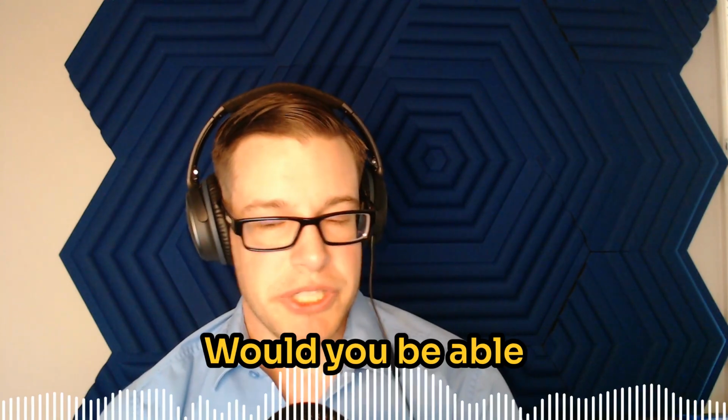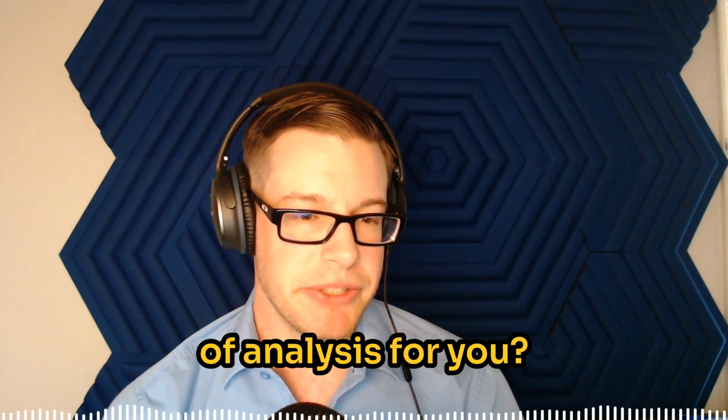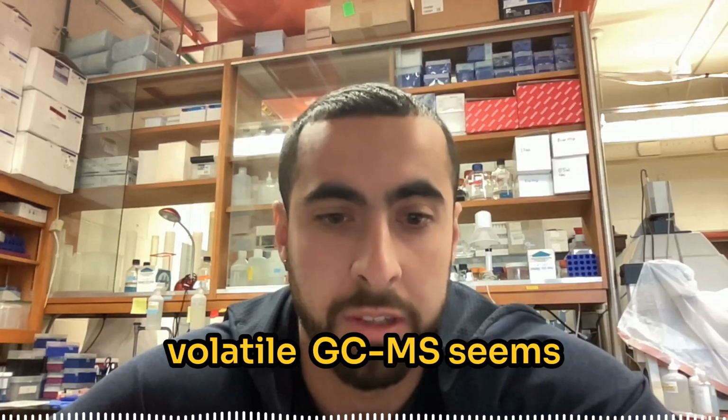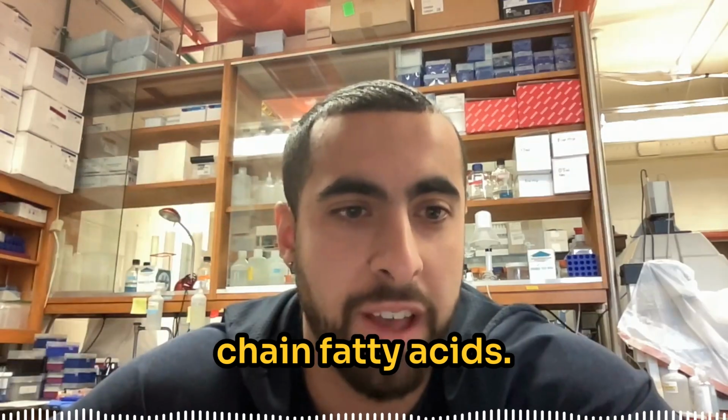That makes sense. Would you be able to talk about why GC-MS is the right type of analysis for you? Yeah, so traditionally with volatile molecules such as short chain fatty acids, since they're volatile, GC-MS seems to be the standard to go for analyzing short chain fatty acids.